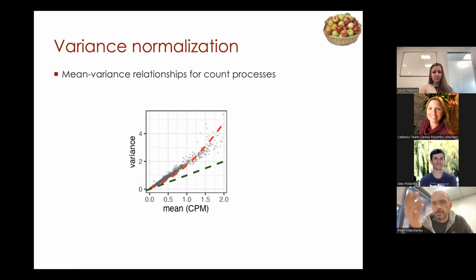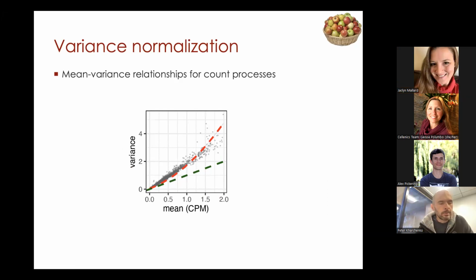You might have a structural, let's say, protein and a transcript for it that's just expressed at high levels, but it doesn't actually distinguish subpopulations. So because we want to highlight subpopulations, we typically want to focus on genes that are variable more than one would expect from this general dependency.